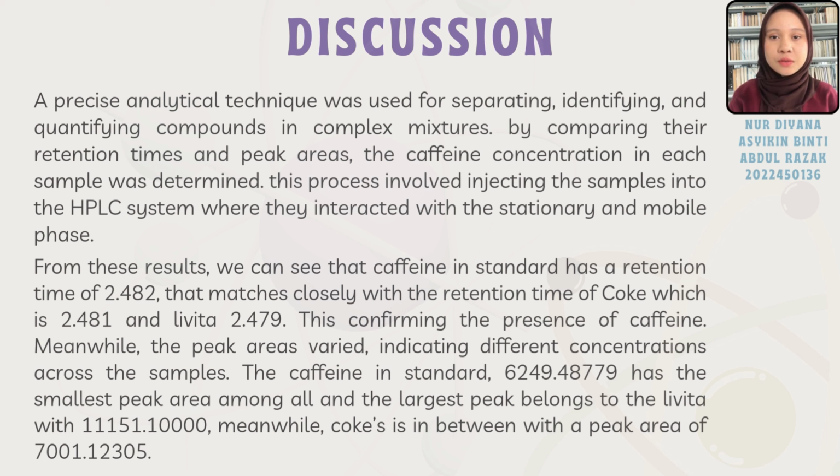From these results, we can see that caffeine in Standard has a retention time of 2.482 that matches closely with the retention time of Coke, which is 2.481, and Levita, 2.479, thus confirming the presence of caffeine. Meanwhile, the peak areas varied, indicating different concentrations across the samples.